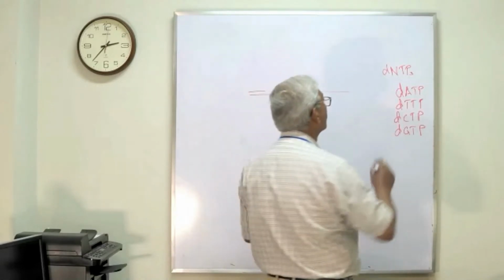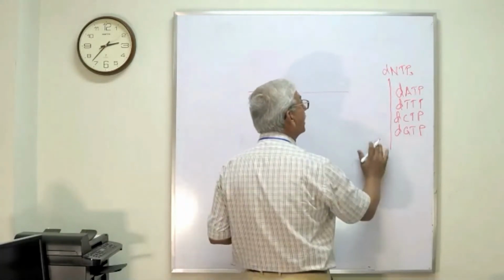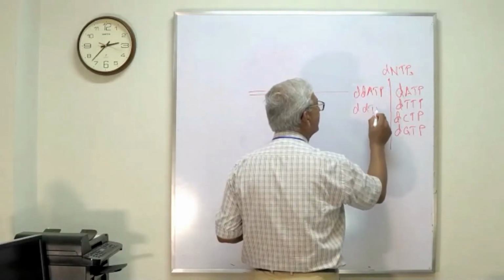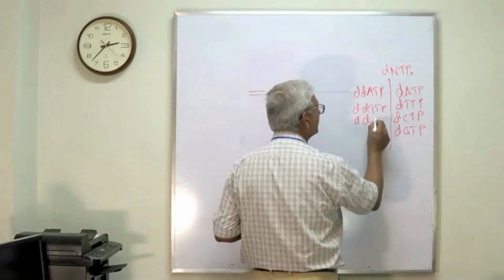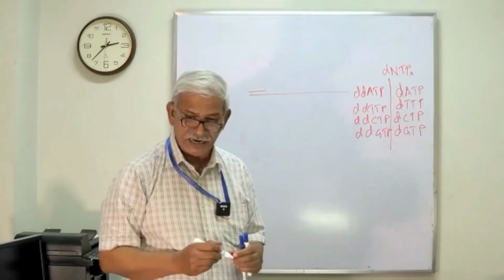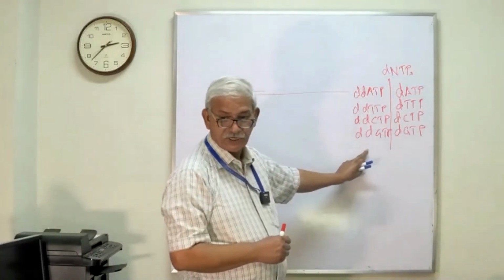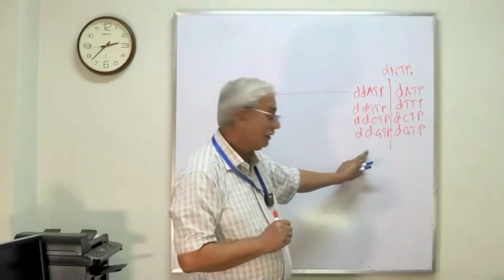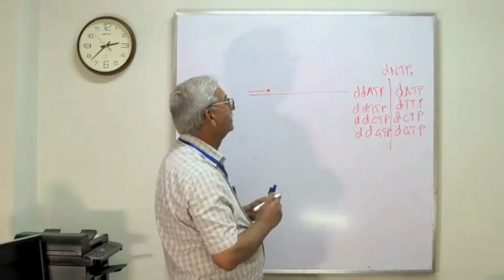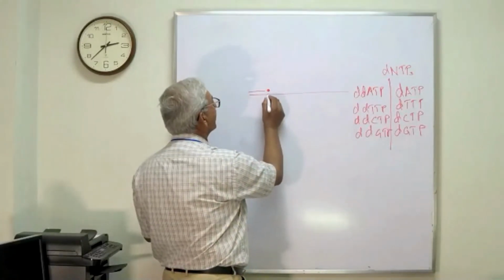Now, what is done in a sequencing reaction is that we also have dideoxy ATP, dideoxy TTP, dideoxy CTP, and dideoxy GTP in the reaction. A sequencing reaction, in addition to the deoxynucleotides, also has dideoxynucleotides. It means that either a deoxynucleotide or a dideoxynucleotide can be added to the growing chain here. Any one of them can be added here if there is a T on this strand.